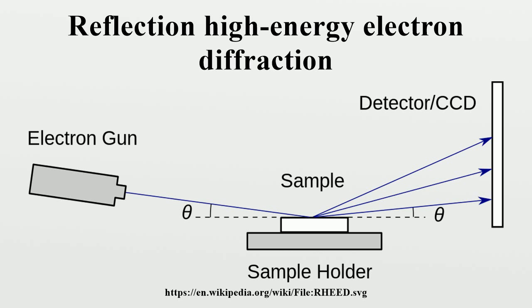Users sometimes rotate the sample around an axis perpendicular to the sample surface during RHEED experiments to create a RHEED pattern called the azimuthal plot. Rotating the sample changes the intensity of the diffracted beams due to their dependence on the azimuth angle. RHEED specialists characterize film morphologies by measuring the changes in beam intensity and comparing these changes to theoretical calculations, which can effectively model the dependence of the intensity of diffracted beams on the azimuth angle.